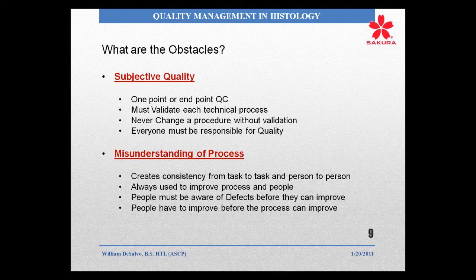And everyone must be responsible for quality. If you're attending this and you're the supervisor, absolutely you have responsibility for quality in your department, but everyone else who works in it should have the same level of responsibility that you do. And they must have the same authority to make changes, to identify issues and be part of the correction process.